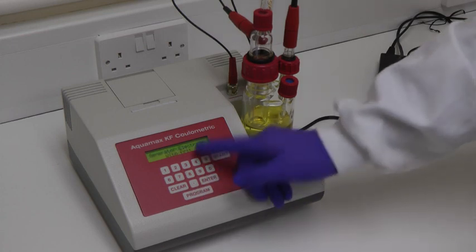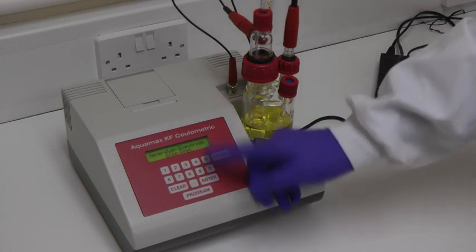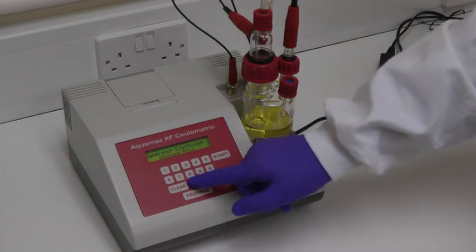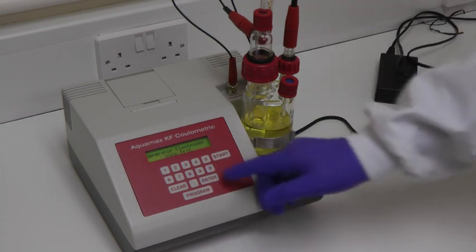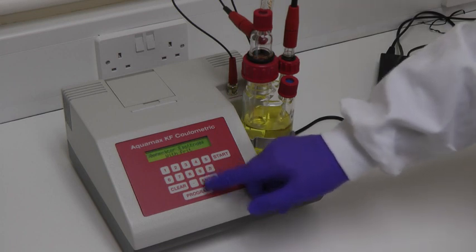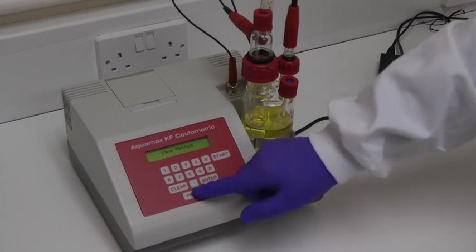The Generator Electrode parameter can be set to either With or Without Frit. This completes the programming, and the method that has just been specified can be saved for future reuse.